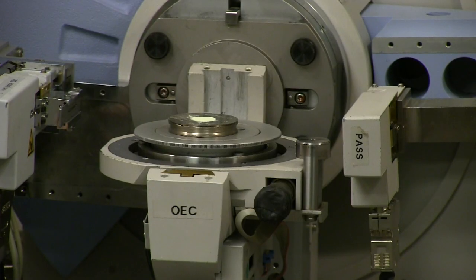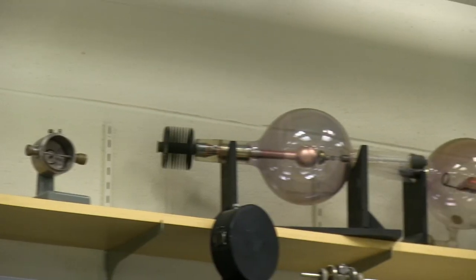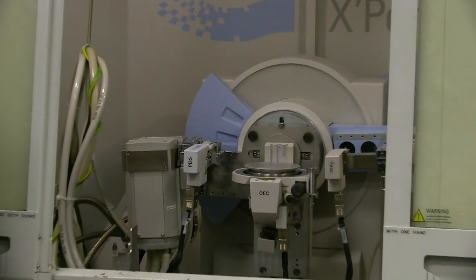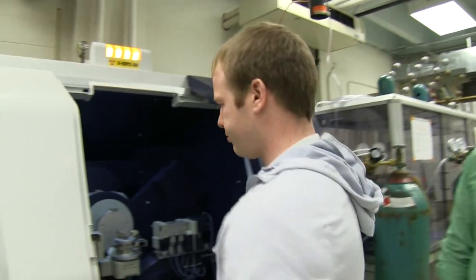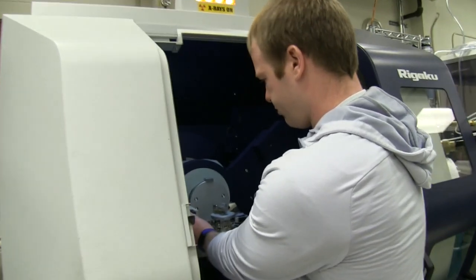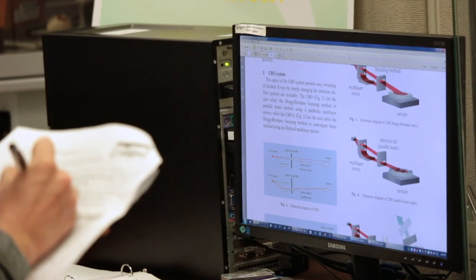Welcome to the MIT Materials Research Laboratory X-ray Facility. I'm Charles Settins and I oversee the X-ray Facility. We have a variety of pieces of equipment in order to perform X-ray diffraction analyses of anything from a powder sample to a thin film to an epitaxial thin film.